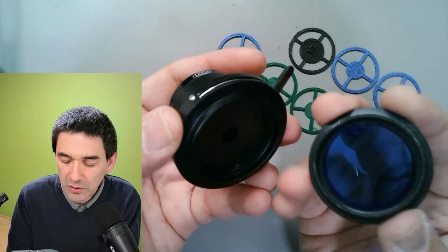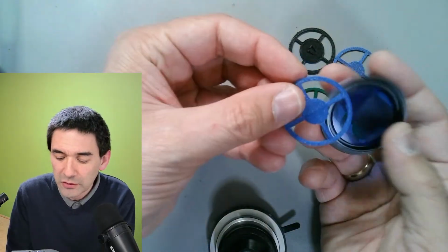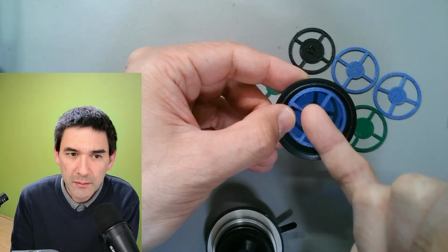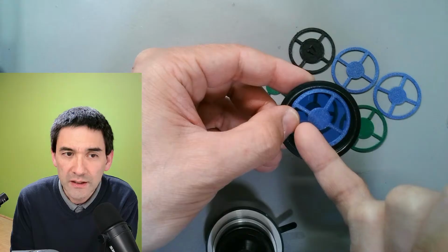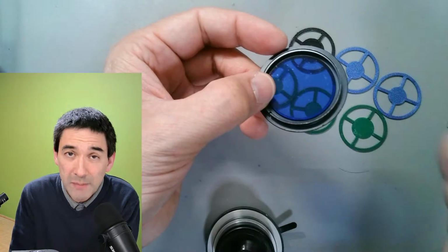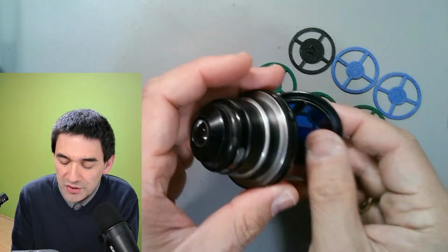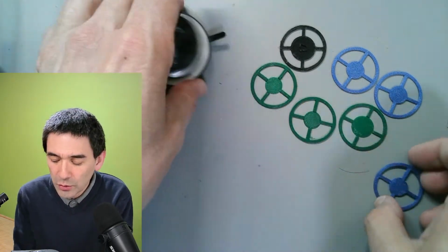So if you have a microscope that looks like this, you need to put in a filter, here the size is not correct because I won't be using this, which essentially blocks out the light on the majority of the area and only allows light to pass on an edge, right? And then you get oblique illumination. Basically, it's light hitting the specimen from the side, and this gives it a more three-dimensional appearance. And I don't need that because I've got a swing-out filter holder, and this allows me a little bit more control.